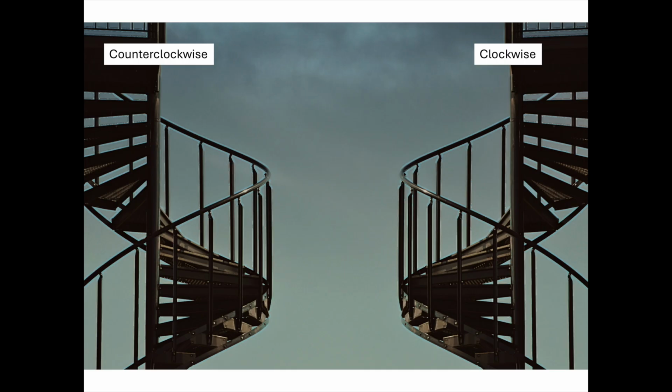The thicker our quartz crystal, the more we can have that spiral staircase rotate the plane of our plane polarized light. Let's move our view around our crystal now and see if we notice anything interesting with our interference figure. Once we enter the different areas of our crystal with the rainbow colored triangles, you'll notice our interference figure gets a bit strange. And what's going on here actually has to do with those spiral staircases we talked about earlier.